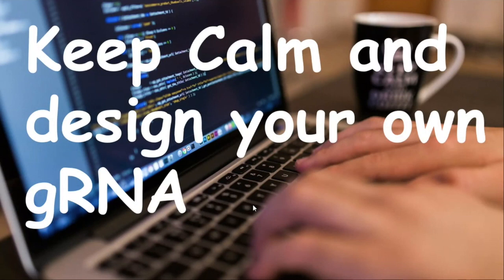Session, which is hands-on training on designing your custom guide RNA. As we have already seen, sometimes it becomes a challenging task for researchers to design the correct guide RNA, and because of this, it can become a challenge to apply this technology in their projects. So this is a little attempt from our side to let young researchers have at least a beginner's understanding of how to design guide RNAs of their choice.